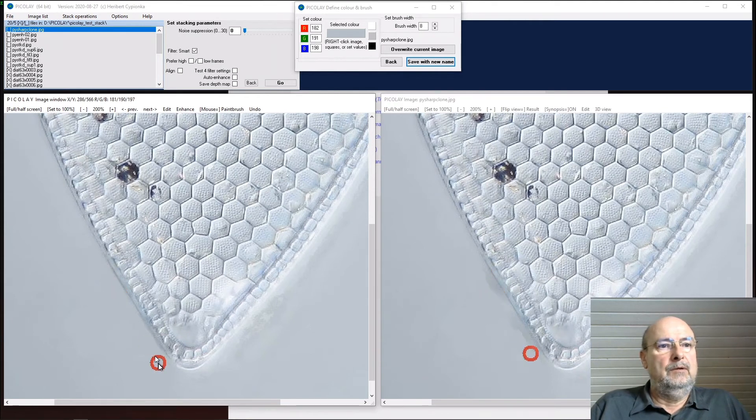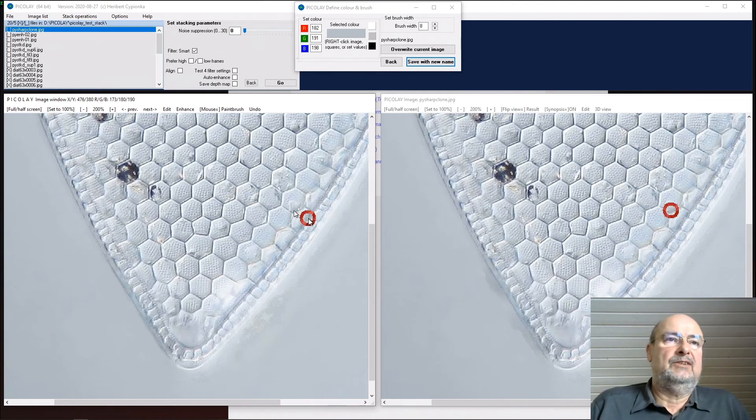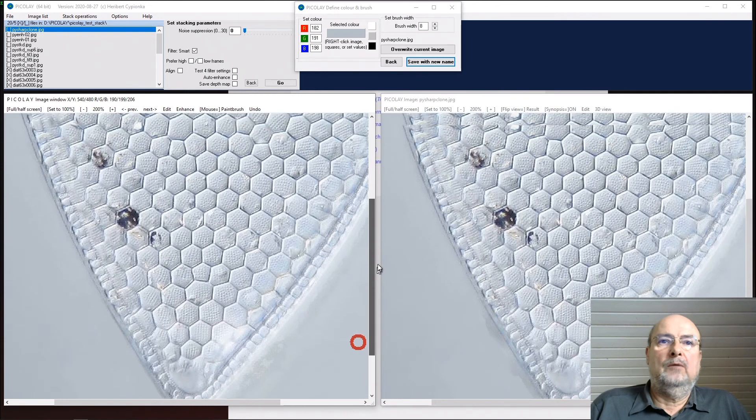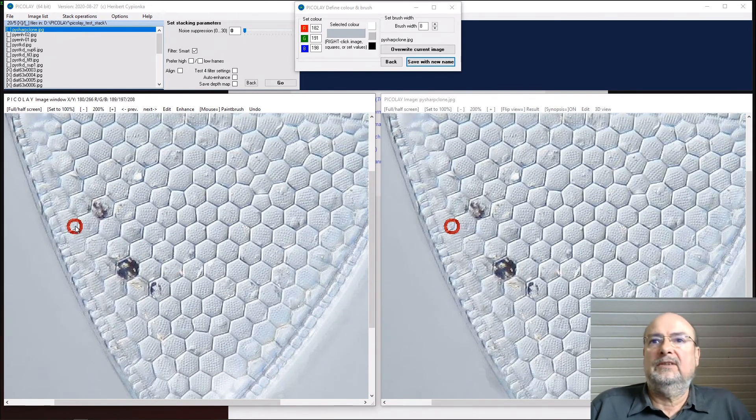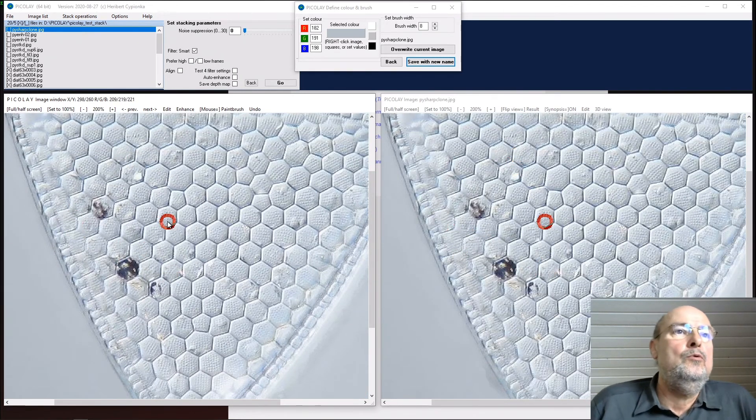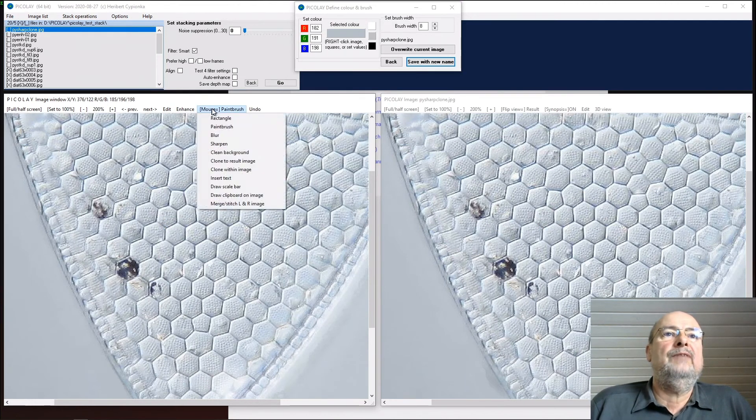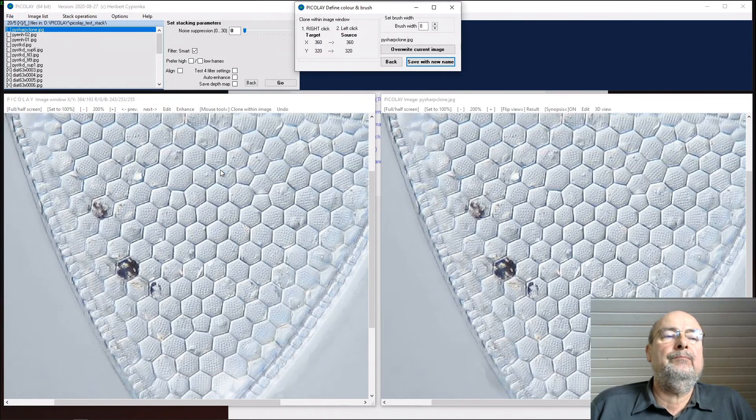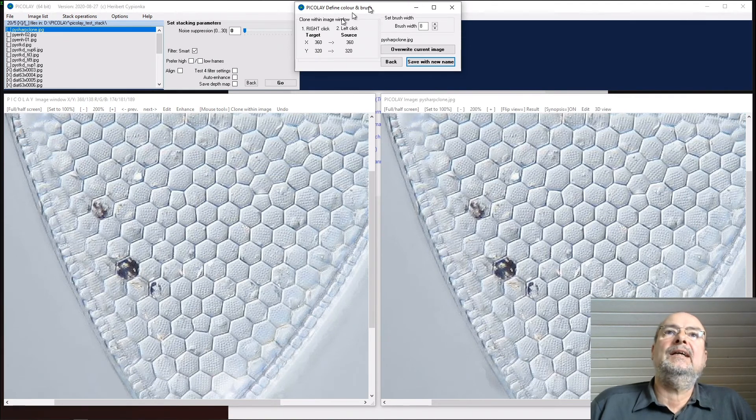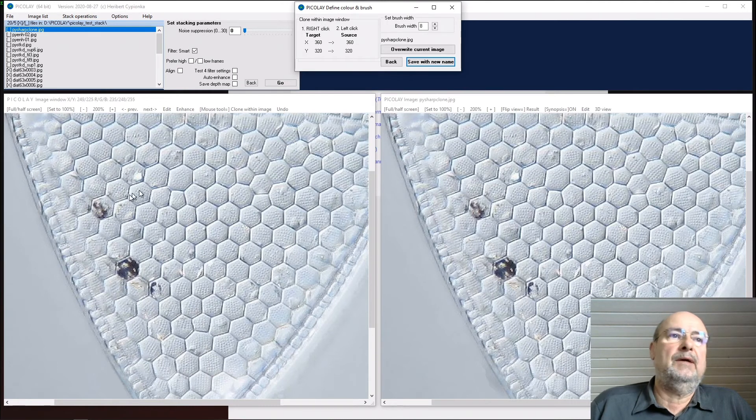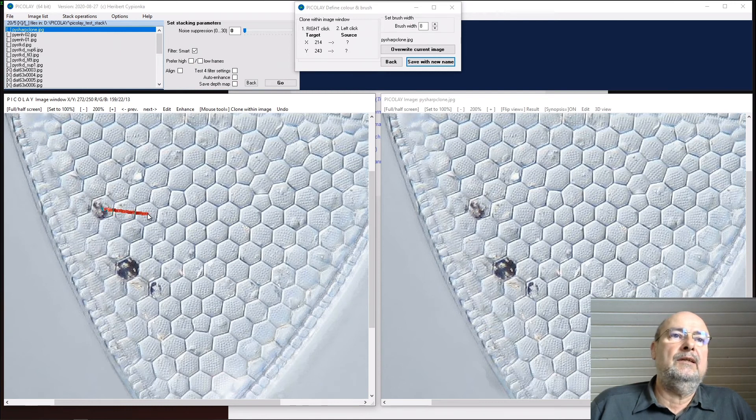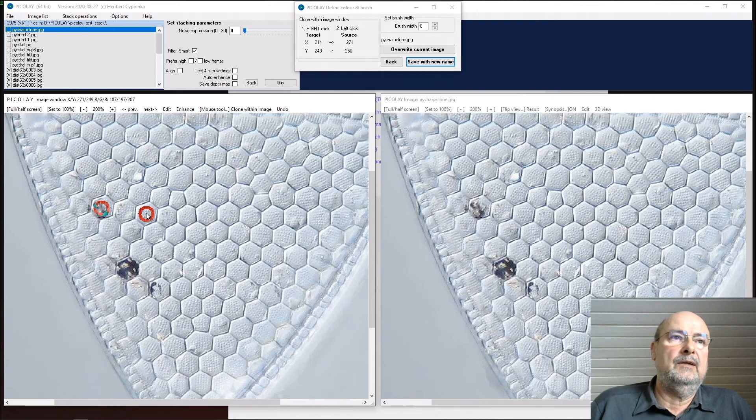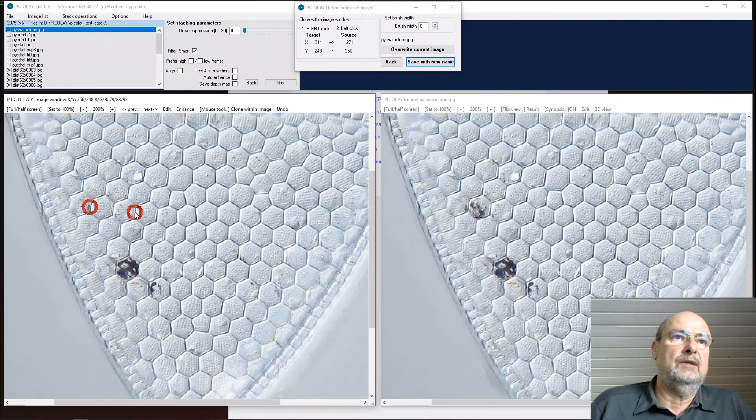And this is really taken from the original images and not really retouching. Now we do some more retouching. These ugly structures here could be removed by using the functions clone within image. And for that, you click with the right mouse button into your target - this ugly cell here - and then you click with the left in your source. Now I can copy from here to there and I can retouch this nicely.